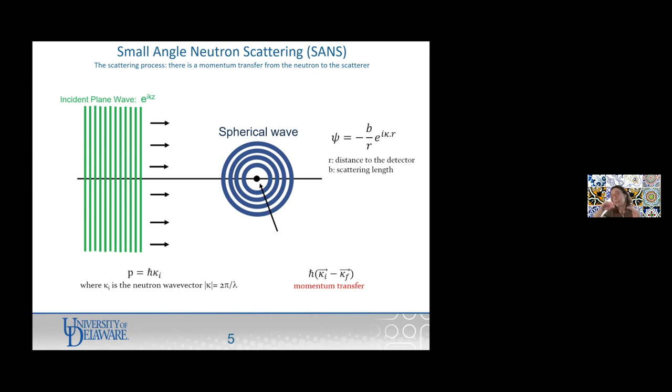So you're looking at reflections, right? You're looking at some surface of interest, which will be, for example, a membrane. If you wanted to know the orientation of a protein that binds to a membrane, how it orients when it comes to that surface, then you would use reflectometry, just to give you an example. In solutions, because the molecule is tumbling in solution, it's all averaged, and you would not get that sort of information. Okay, thanks. So the resolution is actually higher.